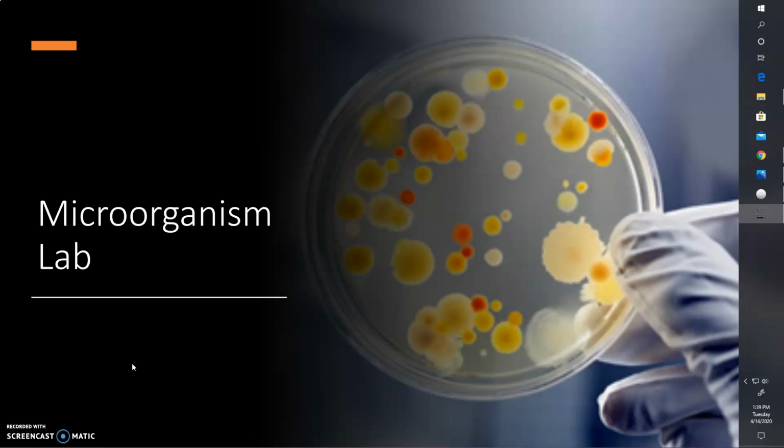I thought this week we could do something a little bit different and try to do some sort of at-home experiment using microorganisms. Now, I call it microorganisms because instead of just bacteria, hopefully it would be bacteria. But when I did it, I got mainly mold, which is a fungus, and who knows? It could be fungus, could be mold. We don't really have the ways to test it at this point. So it's just microorganisms, and I thought it'd be kind of fun to do a little experiment and see what we come up with.